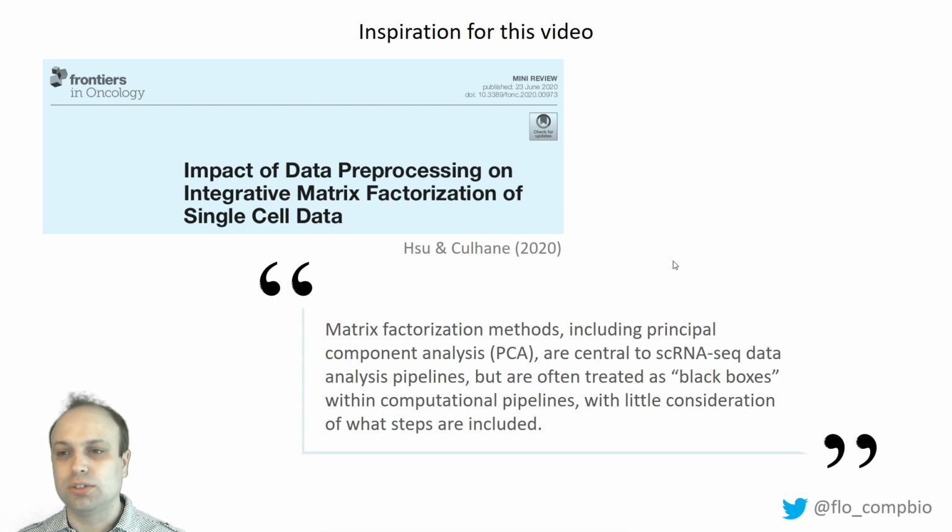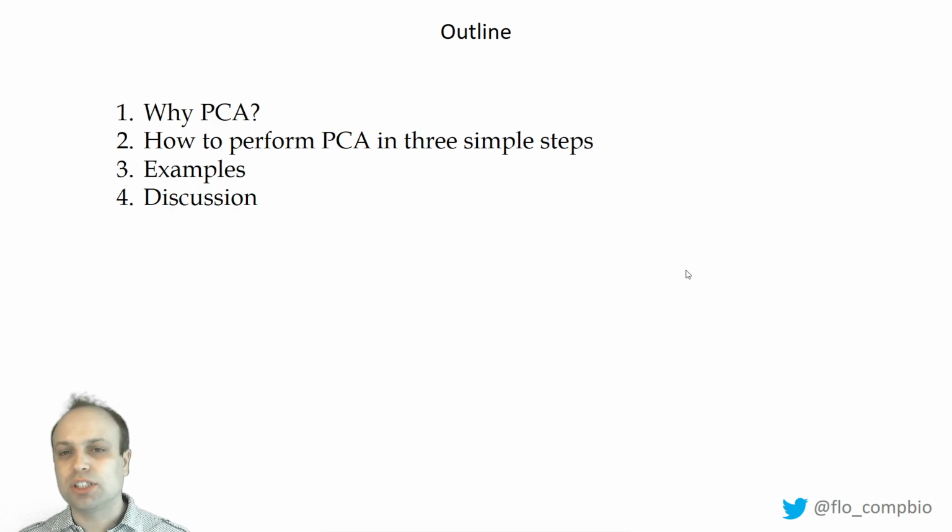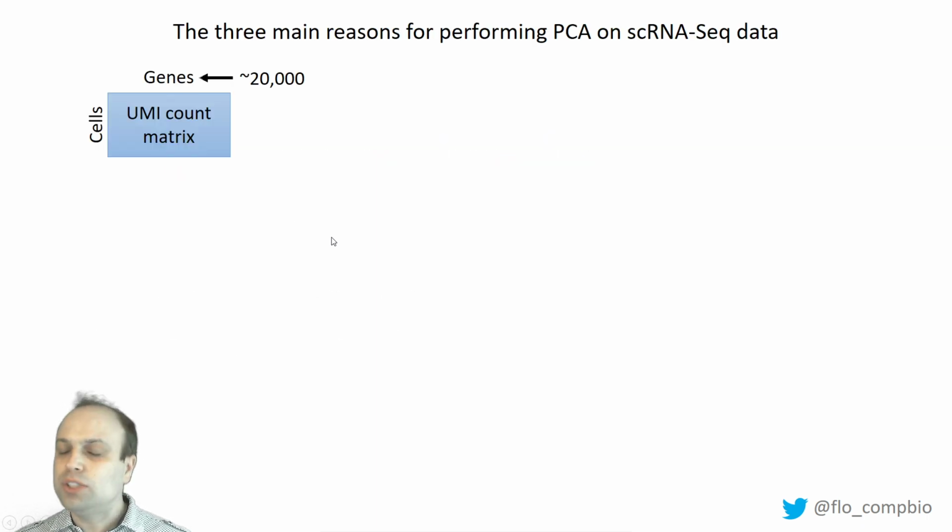So I wanted to make a video about how I do PCA and how concretely you can get pretty good PCA results. So I'm going to talk a little bit about why we're doing PCA, and then how to perform it in these 3 steps. And I'm going to show some examples, and at the end I'm going to add a little discussion. Okay, so why are we doing PCA?